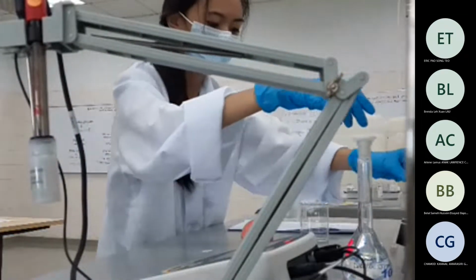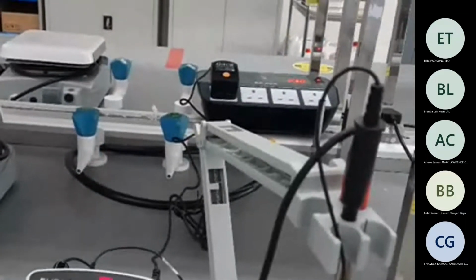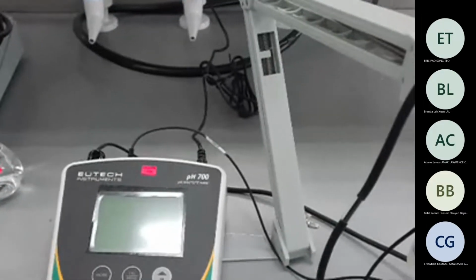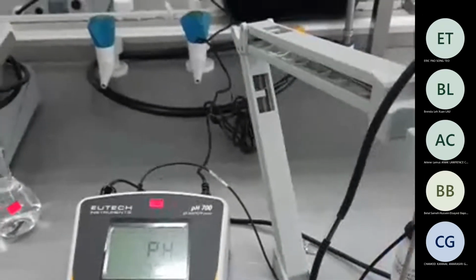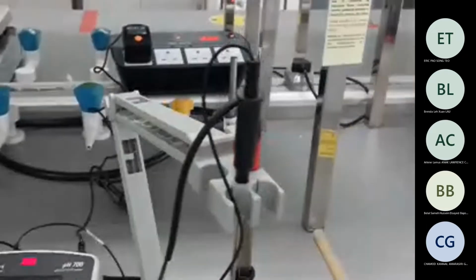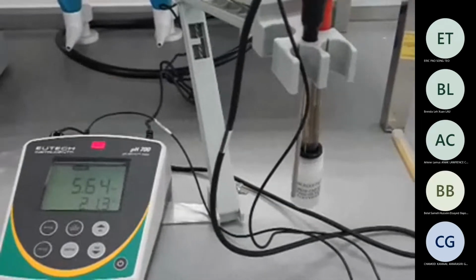One thing, come here, I'll show you the pH meter. Have you used it before? No. So this is the pH meter, and I plugged it in. This is the power button. This pH meter needs to be calibrated once every day, and our lab assistant, she's good, she did it for us, so we don't need to do it.